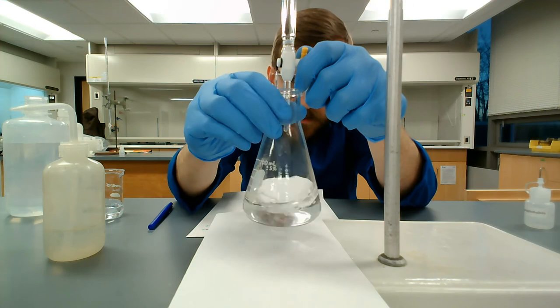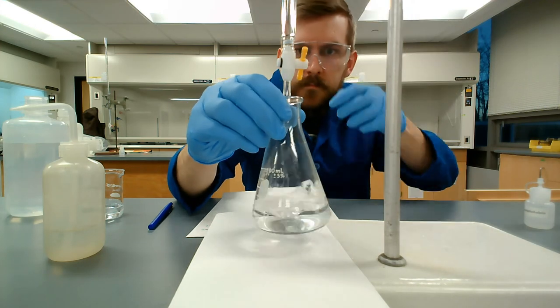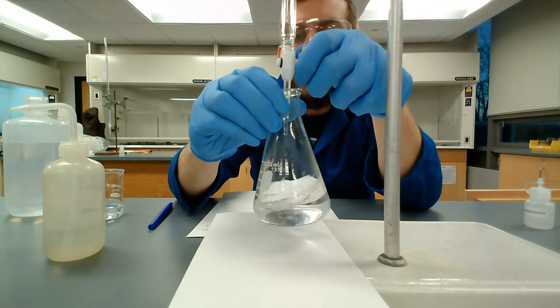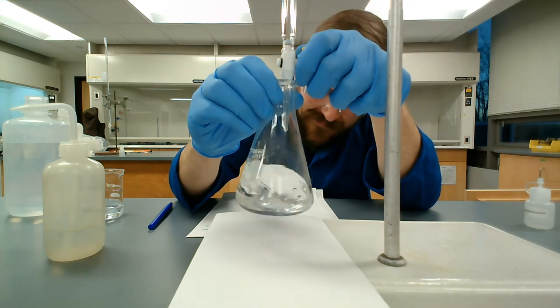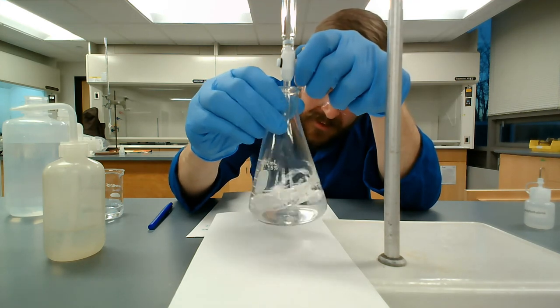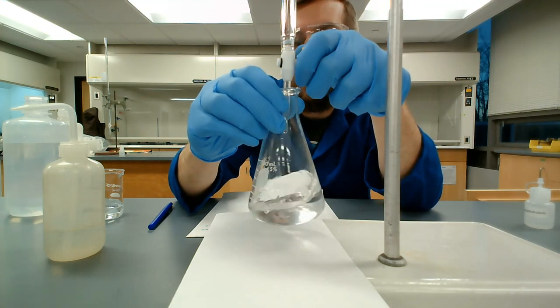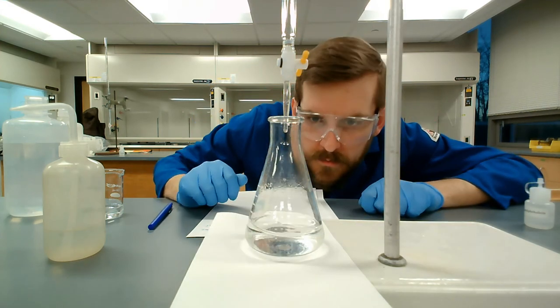So again, start with a wide open stream. Once you get kind of close, see that pink color start to show up, go slower, maybe a drop every second or two. Once you see that pink start to stay around for a little bit longer, go to a drop every 2-3 seconds, right? So I'm slowing down. I'm twisting my hand a smidge to slow the drip rate a bit. I think I'm getting really close. I think this is the best titration I do in this video.